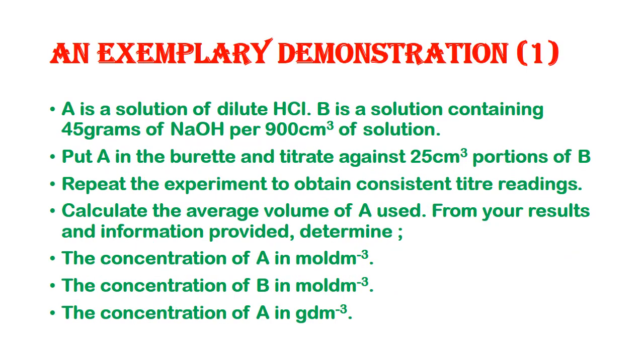Okay. Now we are faced with one example, an exemplary demonstration. This is the way you are expecting it to come. This is how it is. It will be similar to this kind. I've already explained how you do it. Now we are faced with an exemplary demonstration.